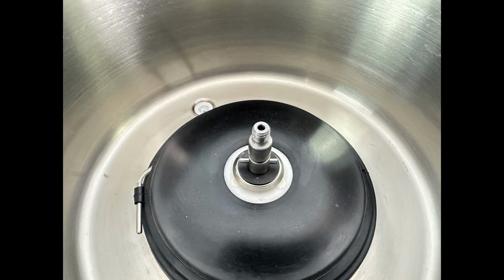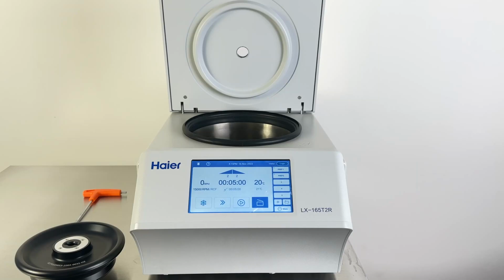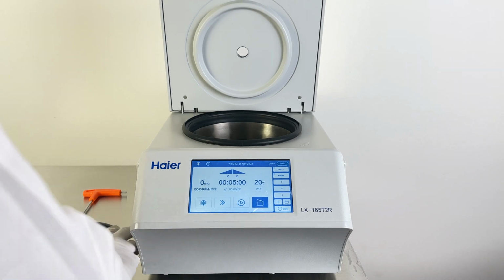So to start off the unit, the first thing you want to do is attach a rotor. Look inside the chamber, you will see the spindle, and there are two pins. You want to set them to 3 o'clock and 9 o'clock. Likewise, on the bottom of the rotor, there are two corresponding grooves. If you set those up to 3 o'clock and 9 o'clock, you're going to get perfect alignment and it's going to be safely attached.